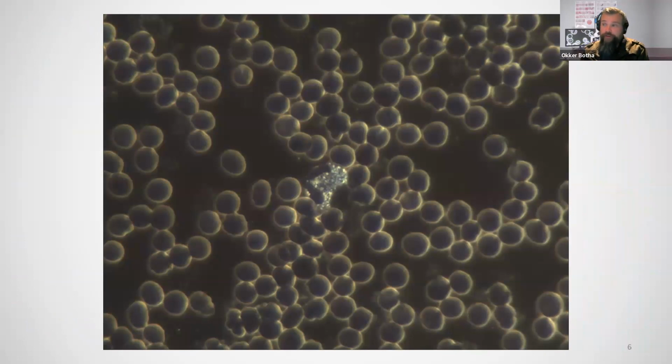So that's also why, if you want to save yourself the trouble of learning all the terminology and becoming familiar with what all the terms and parts of the microscope mean and what they're for, a simple way to get past all of that is to just ask for a sample image of live blood in dark field with the microscope. So if you're considering buying a microscope for live blood analysis, ask for a sample image of a live blood sample in dark field specifically, to actually see what it looks like. And looking at this image, you can see right away that it certainly doesn't have what it should have for dark field.